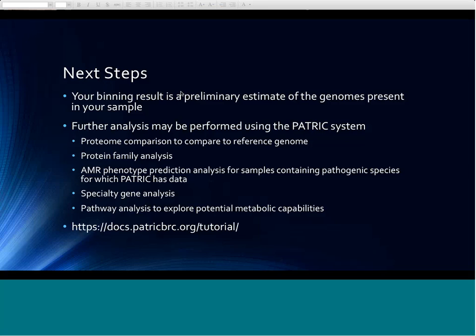Okay. These are coming in pretty quickly. Just to follow up on that one, are there any plans to include eukaryotes in the future? I don't think so, at least not in the context of the current PATRIC project. But I wouldn't say it's out of the question, though. What would you say, Bob? I think that's correct. Yeah.